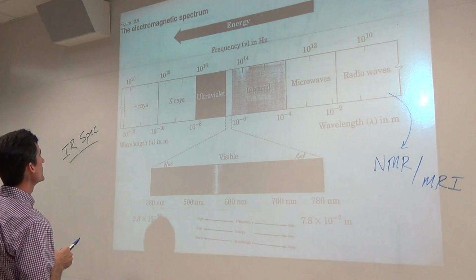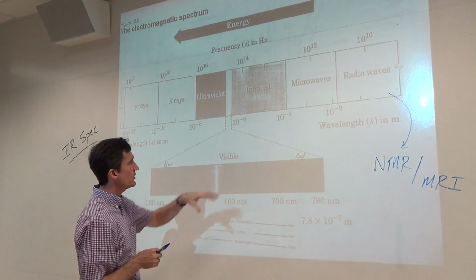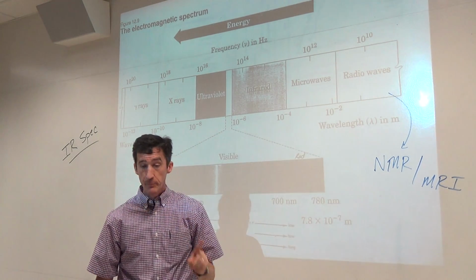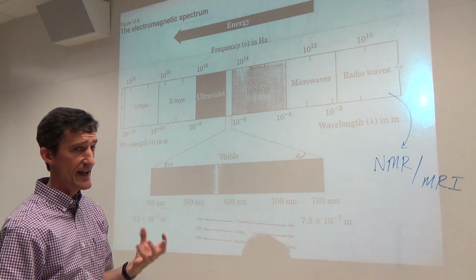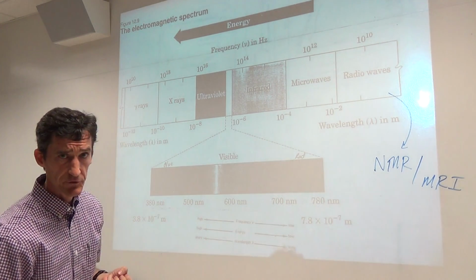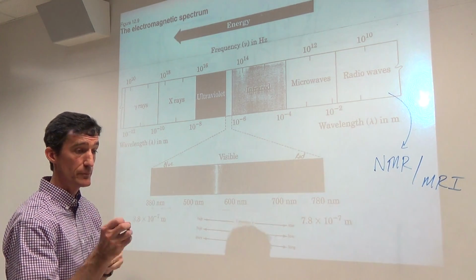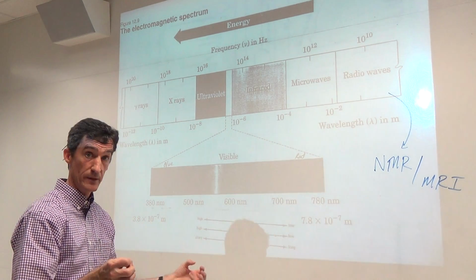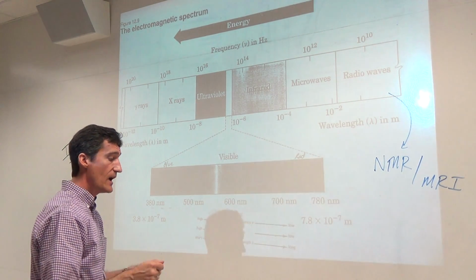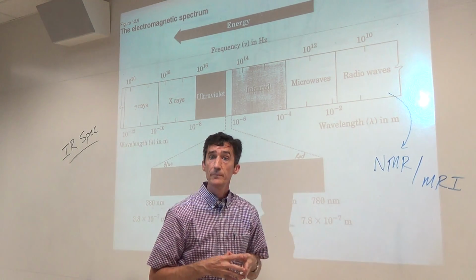What else can we do here? Let me go back to more types of vibrations. Okay, IR deals with vibrations of bonds. A lot of students think we're dealing with atoms, and they'll say, well, the bromine gave this in the IR. The bromine atom doesn't do anything. It's the bond. So the bromine bonded to, per se, a carbon, that bond has a stretching frequency. There's other types of frequencies that a compound can have.